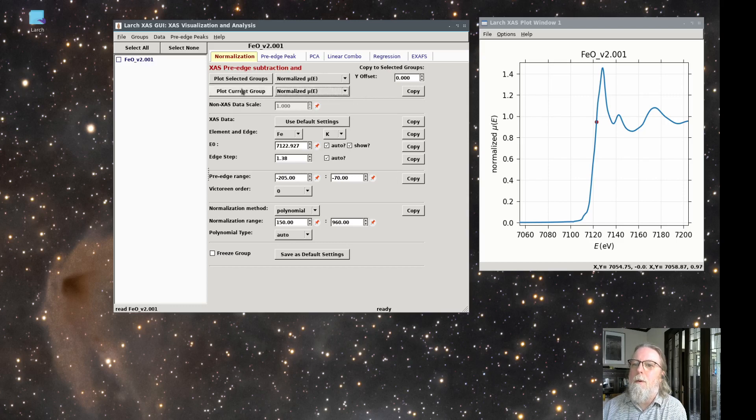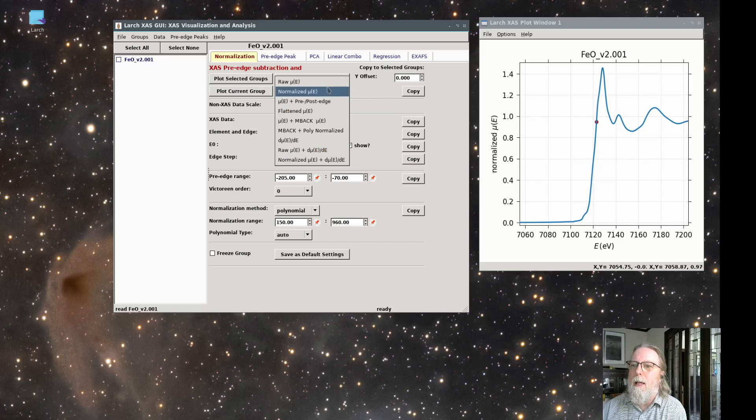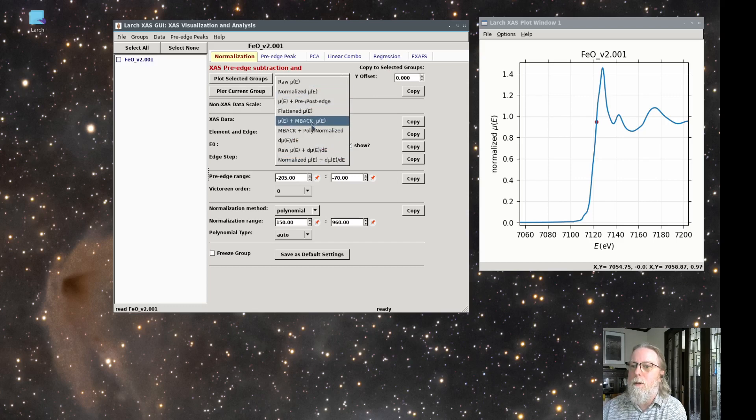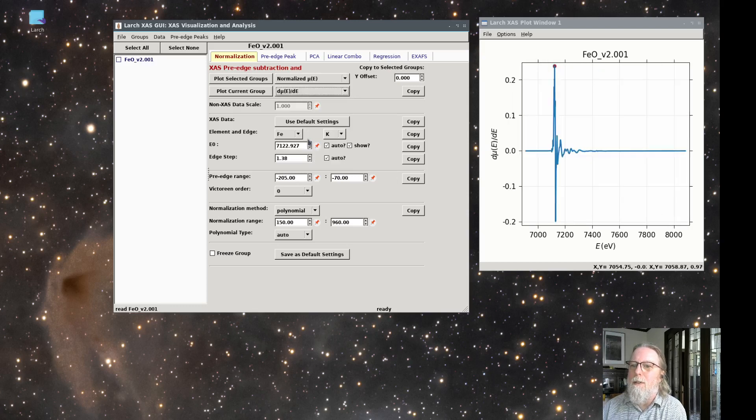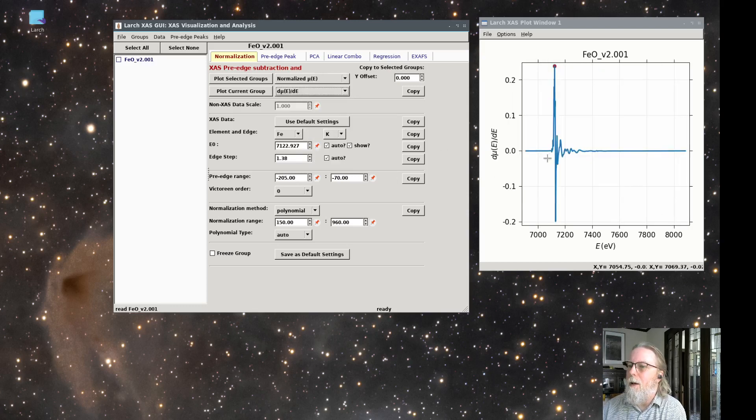Here, for plot current group, we can select a number of different ways to represent the data, different ways of looking at the data. And we'll go through effectively all of these in this video.